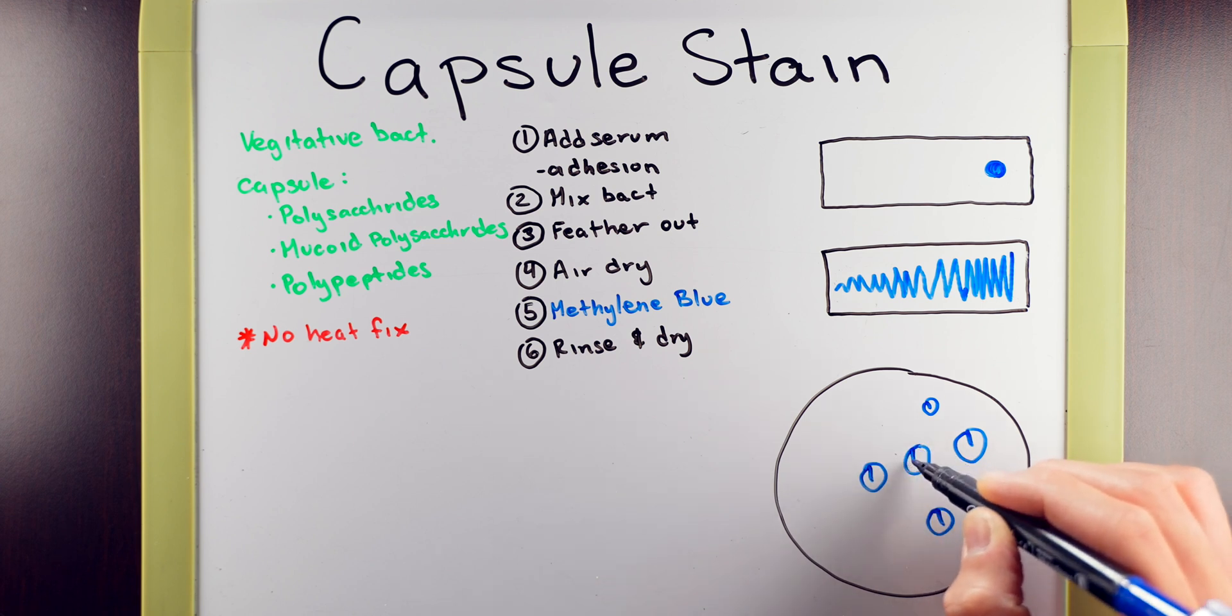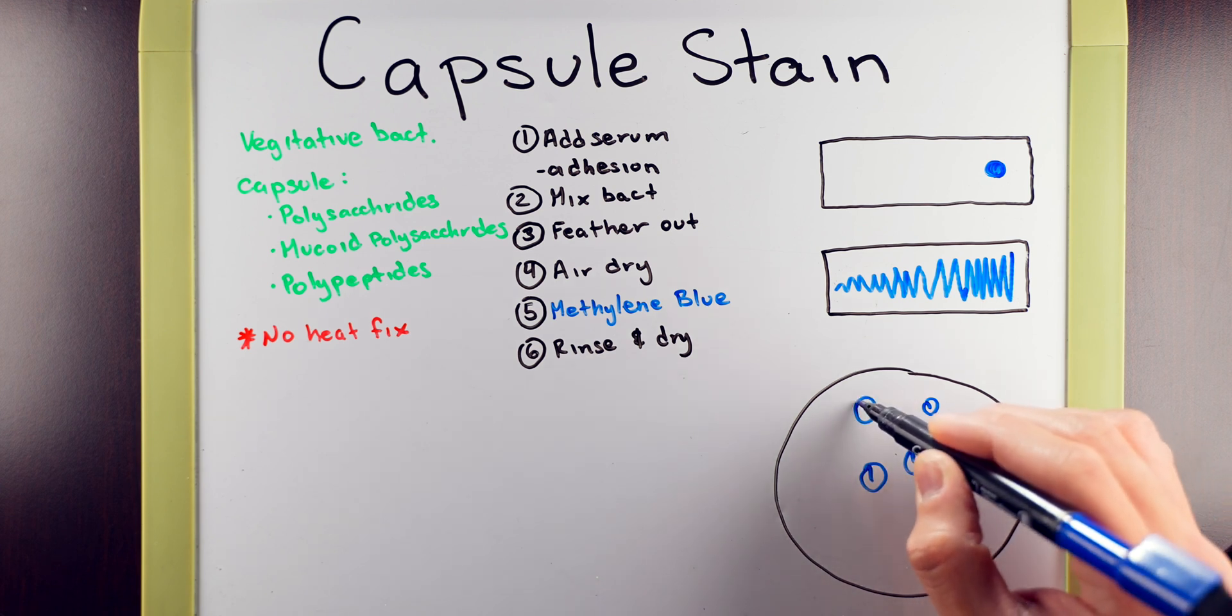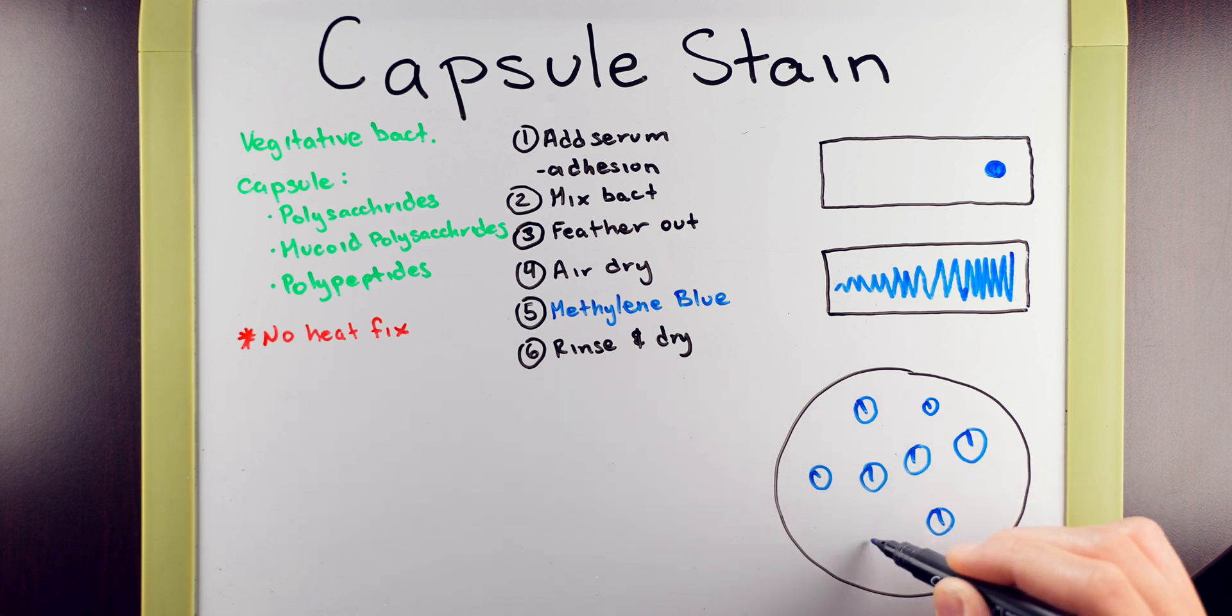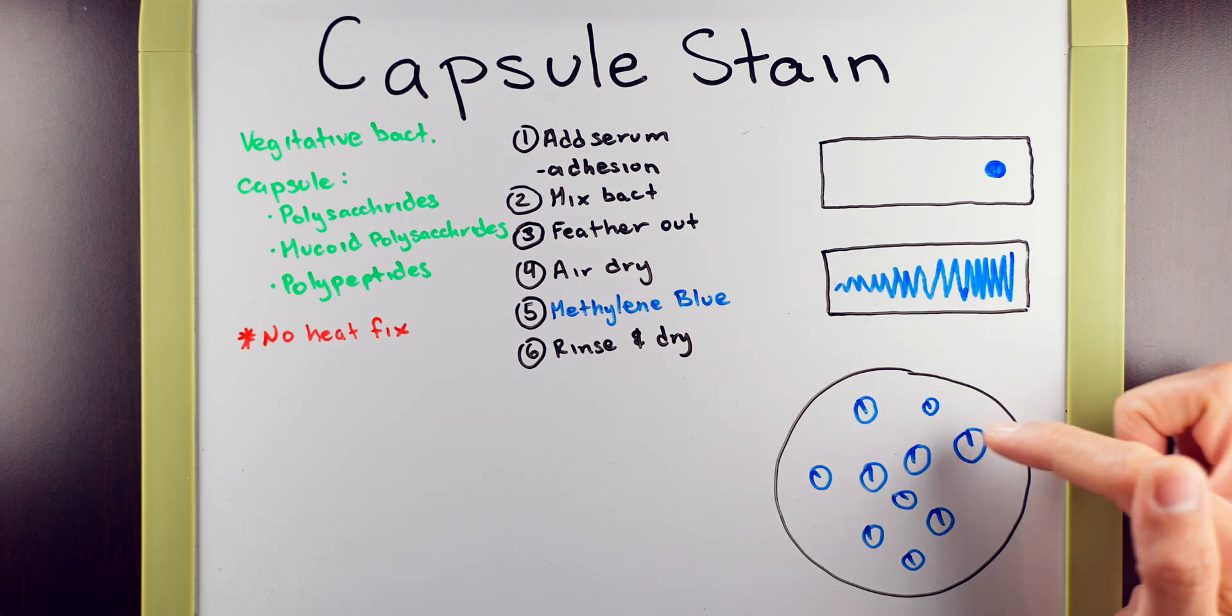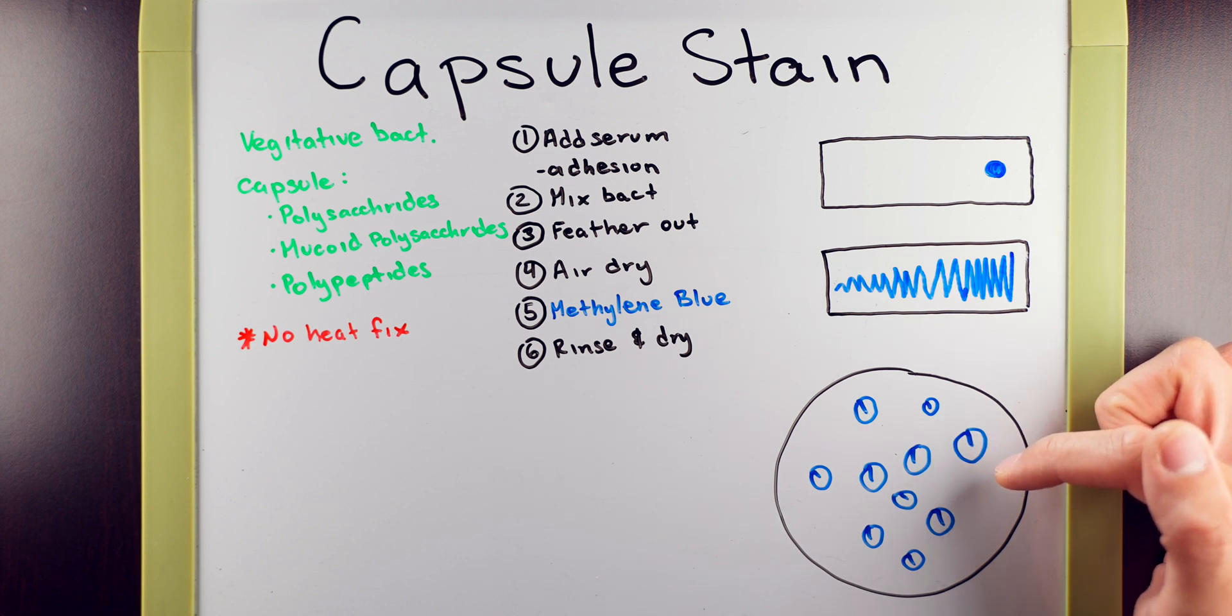You might be wondering, this isn't like any bacteria that I've seen before. I'm normally used to seeing the circles, the rods, or the spirals. And what is this? Well, this circle here is actually the capsule, and that line inside is the vegetative bacteria.